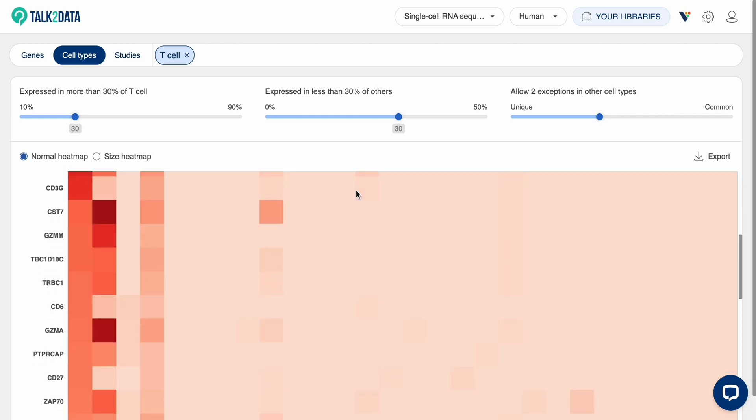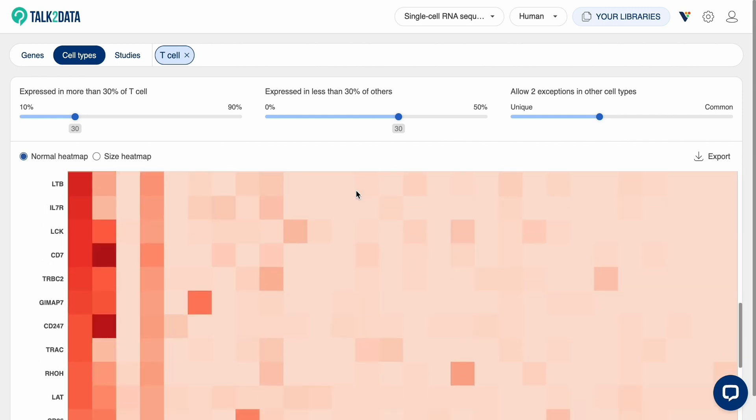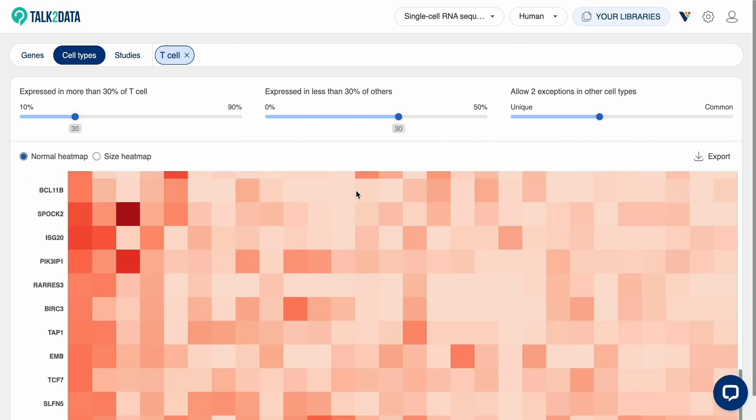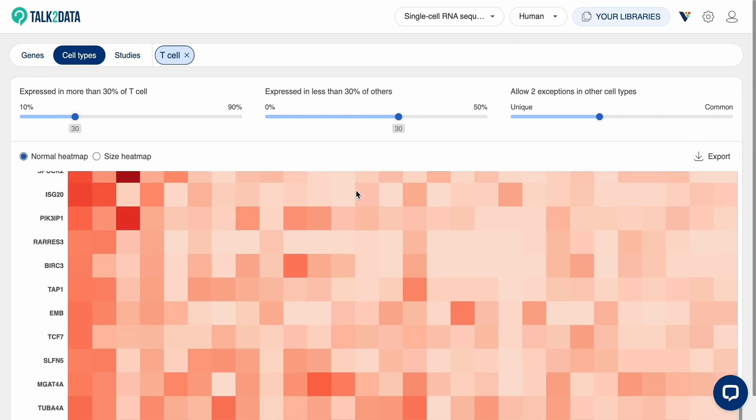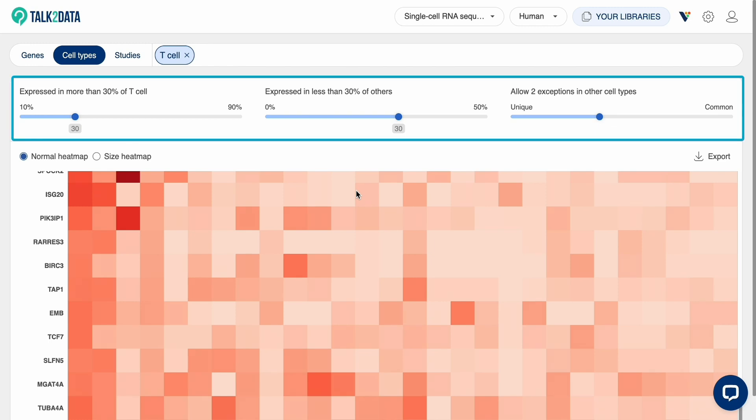The color intensity reflects the percentage of cells expressing the gene. The three parameters above the map allow you to adjust the strictness of the search.